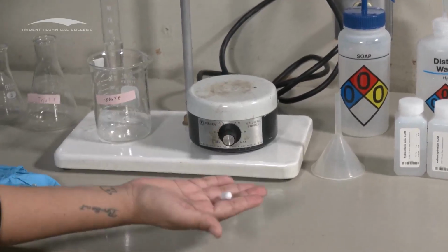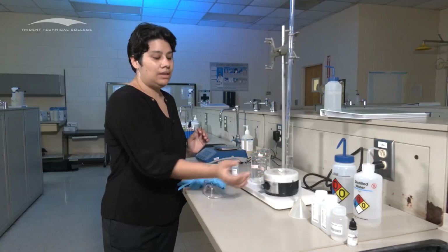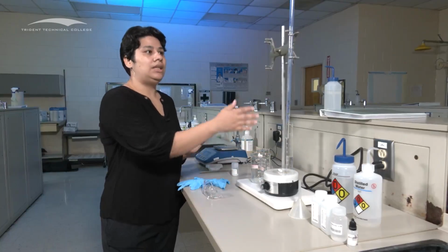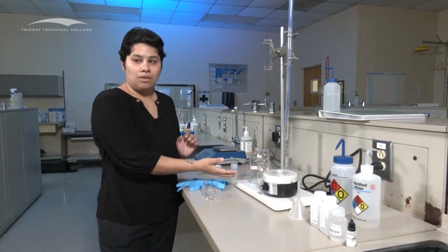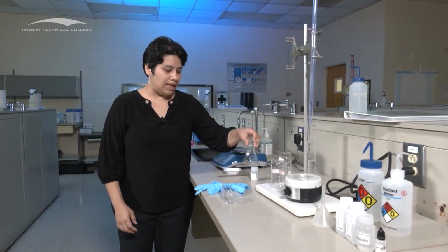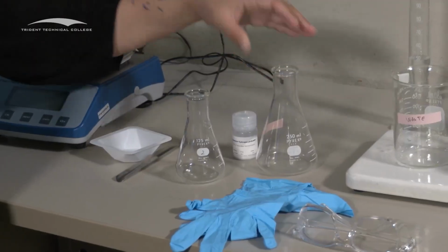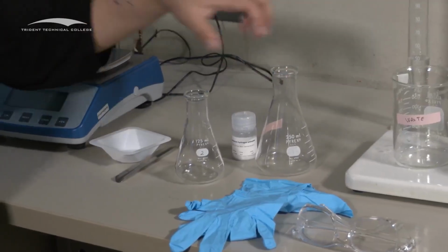Then you're gonna need this little tiny white pill. This is a magnetic stir bar. So if you see, it's magnetized to it. You're gonna need your burette stand, a waste container. Then you are going to need an Erlenmeyer flask. You're either gonna need a 125 or a 250. It doesn't matter which one you grab. Either of them work well.